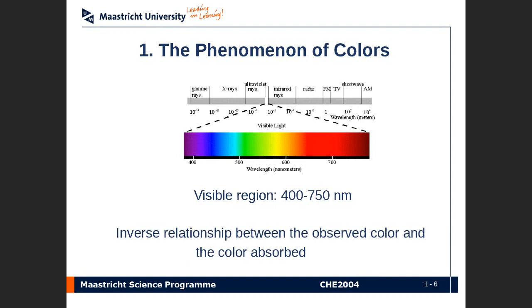It means it absorbs in the reciprocal region, maybe something like blue, right? And that absorption doesn't happen haphazardly, it is quantized. It absorbs a specific wavelength due to the chemical structure and due to the specific energy requirements for electrons to be promoted to a higher energy level.